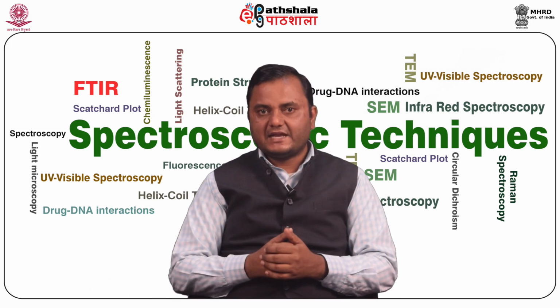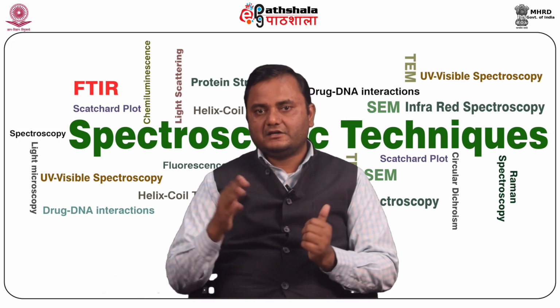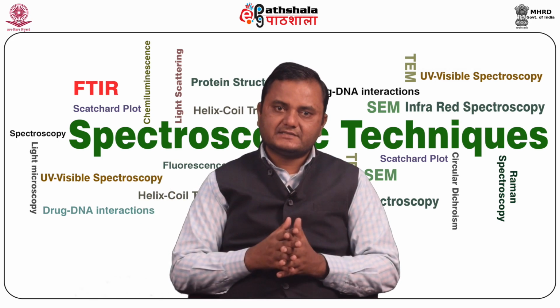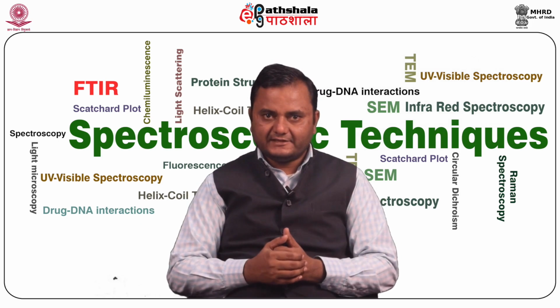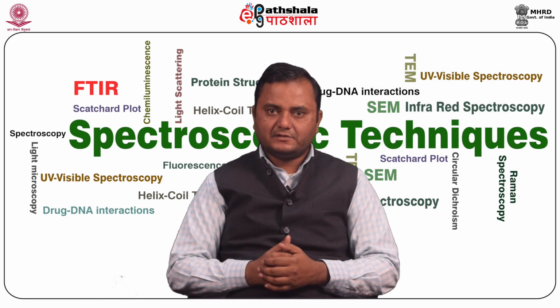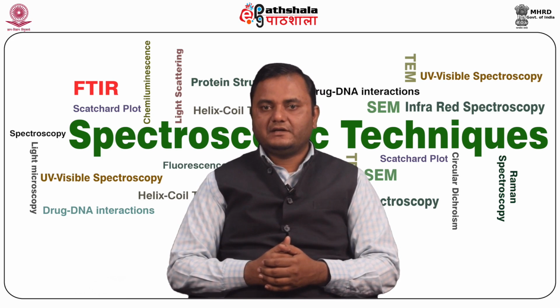Some FTIR scanning parameters: for two widely spaced lines, taking data over a short path difference is sufficient to resolve these lines. For two close lines, the interferogram must be measured over a longer path difference to get a satisfactory spectrum. Two closely spaced lines are only separated if one complete beat is recorded.